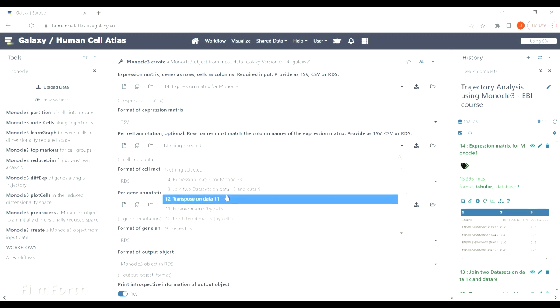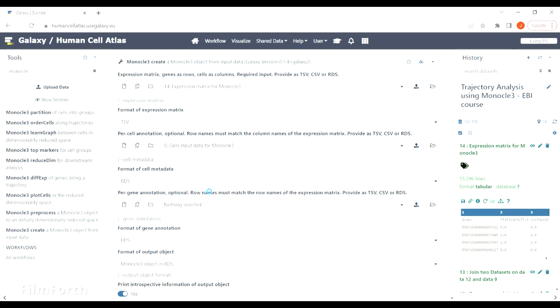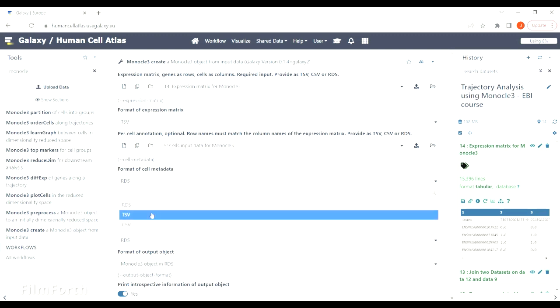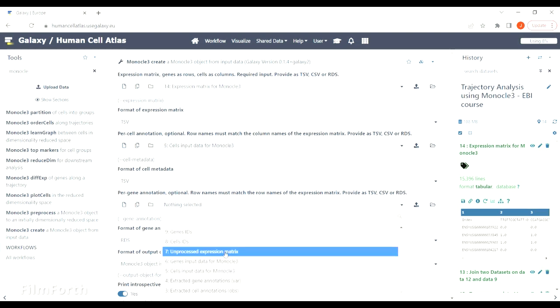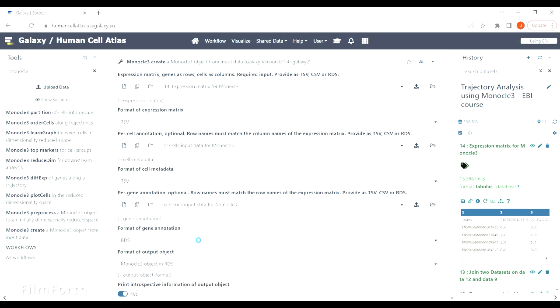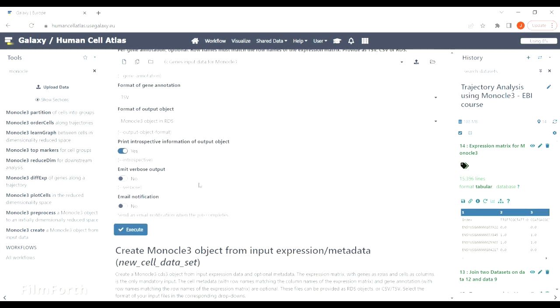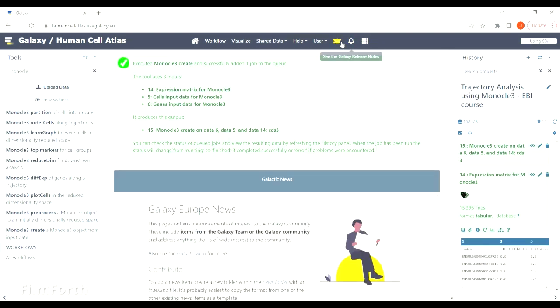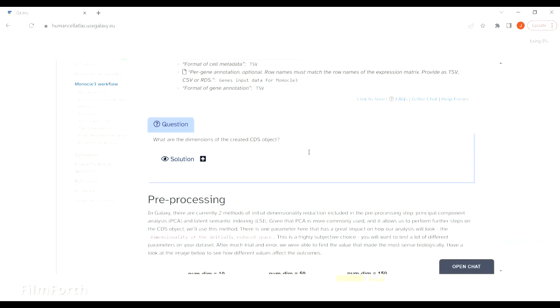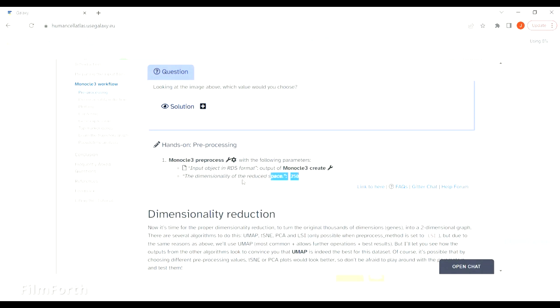Make sure that you choose the correct format of the file. In our case we are using TSV file, but it's useful when you work with your own data in other formats. The next step is preprocessing.